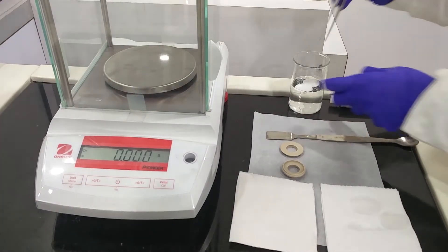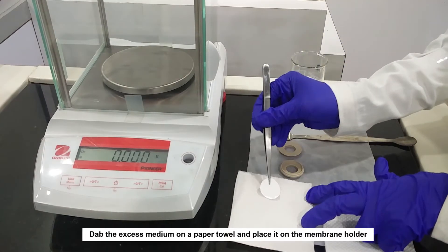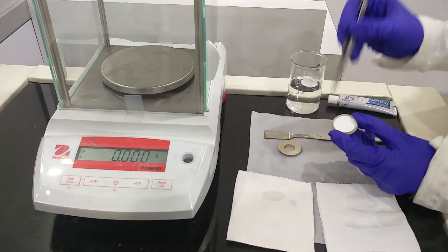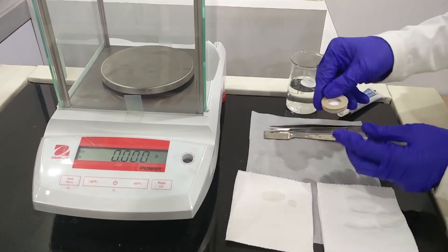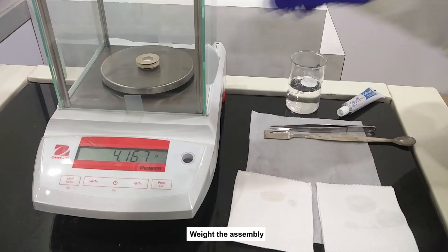Cell Preparation: Equilibrate the membrane in the medium. Dab the excess medium on a paper towel and place it on the membrane holder. Place the cell cap on the membrane holder, then place the membrane holder assembly and weigh the assembly.